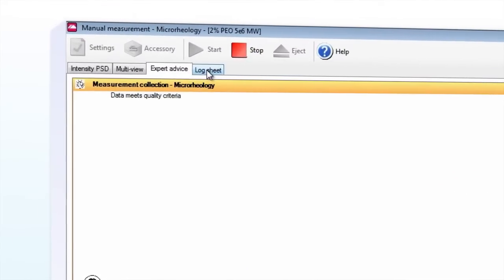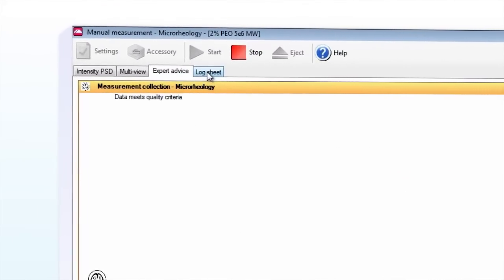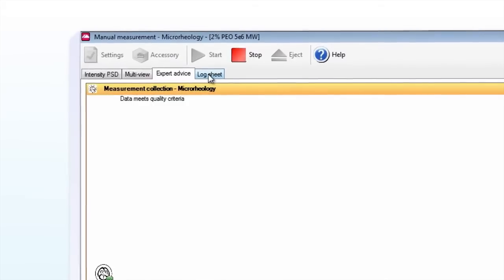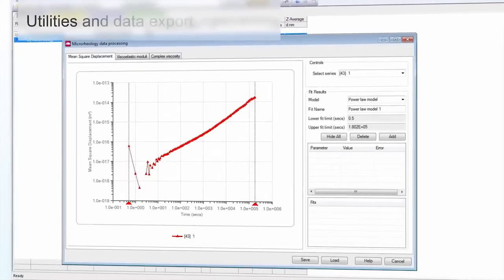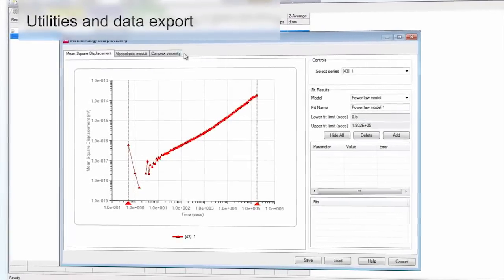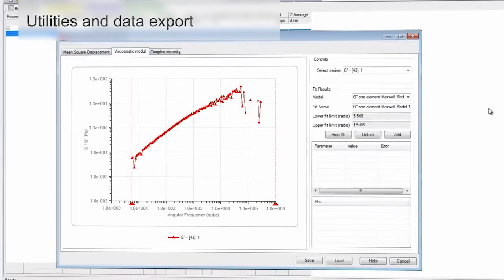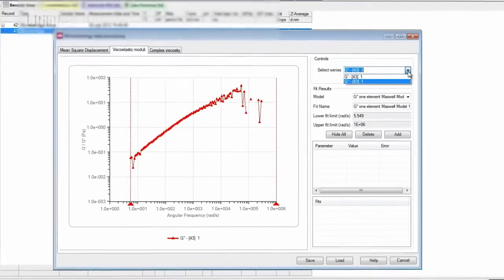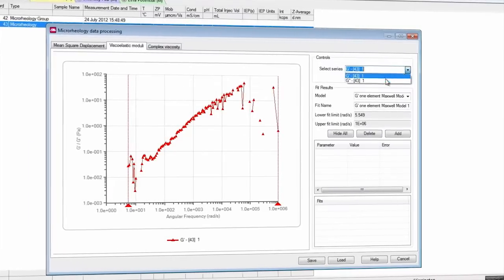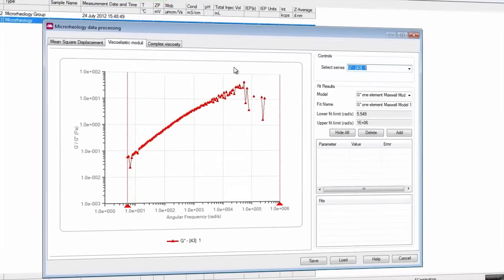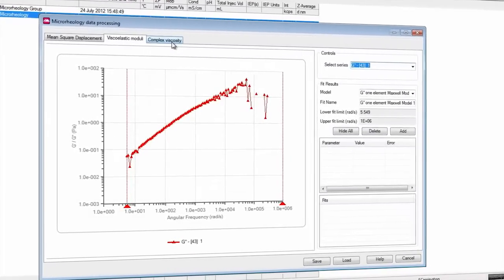As with all Zetasizer measurement types, the microrheology measurement presents software expert system guidance on the quality of the data. The microrheology utilities panel shows three charts: the MSD, the viscoelastic moduli and the complex viscosity with data range selection and model fitting available. The data can also be easily exported to allow for use with a wider range of rheological analyses.